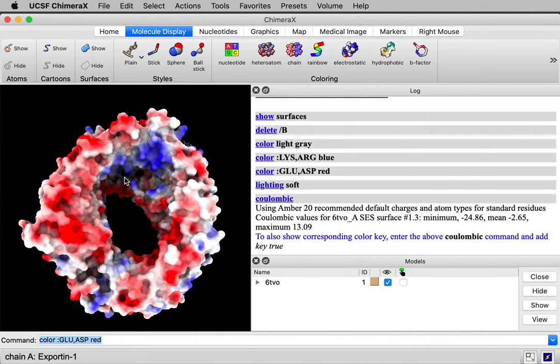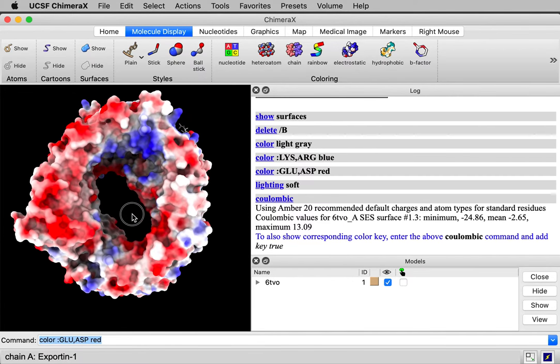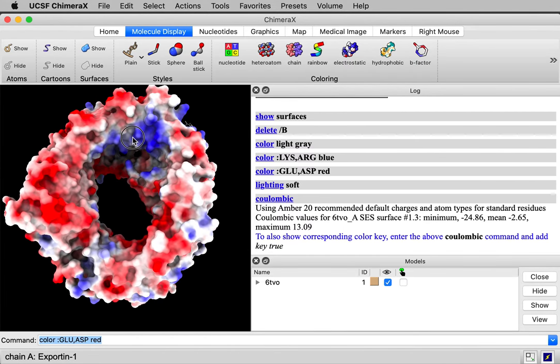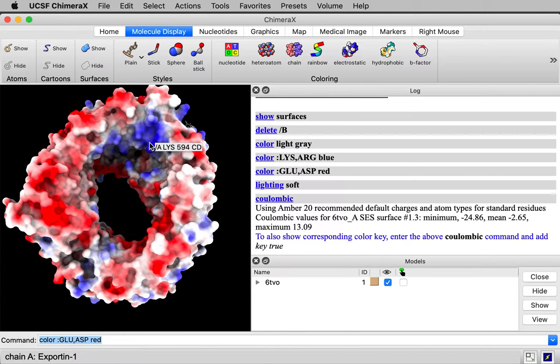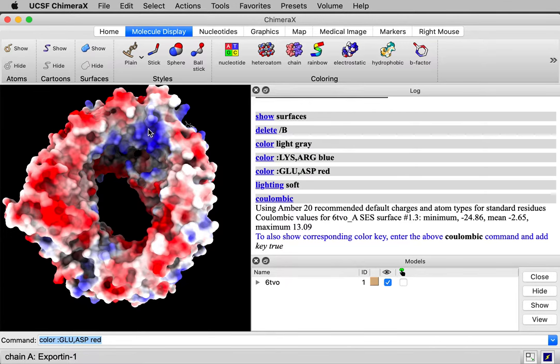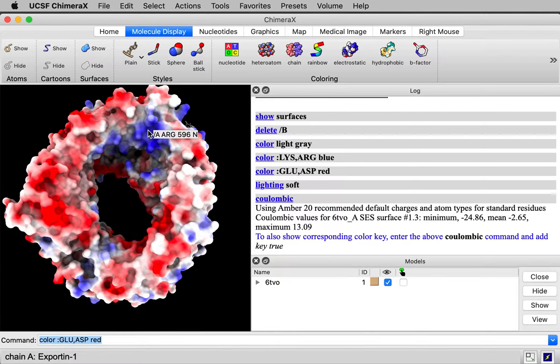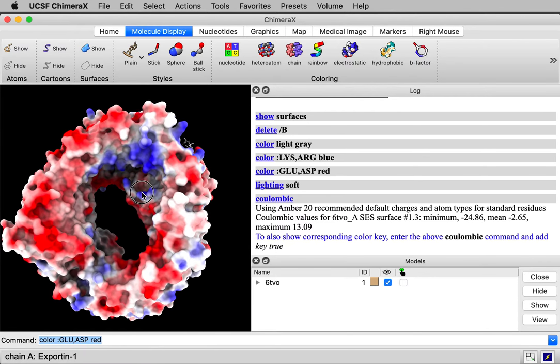This protein that escorts other proteins out of the nucleus of the cell into the cytoplasm, for instance proteins that help regulate gene expression. An important part of it is this blue patch, this positive patch. Once it's released the protein that it's escorted outside of the nuclear pore, it doesn't want to pick that protein back up and end up bringing it back into the pore. And this blue patch, this positive patch, is important for stabilizing the conformation outside after it's released so that it doesn't bring it back into the nucleus of the cell.